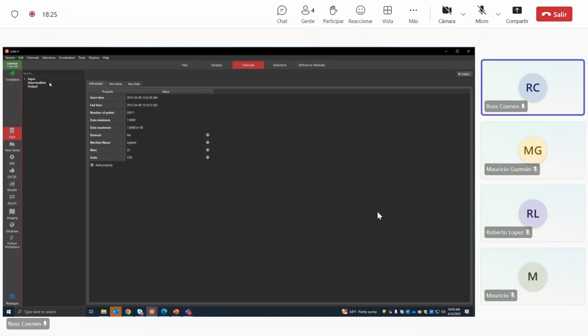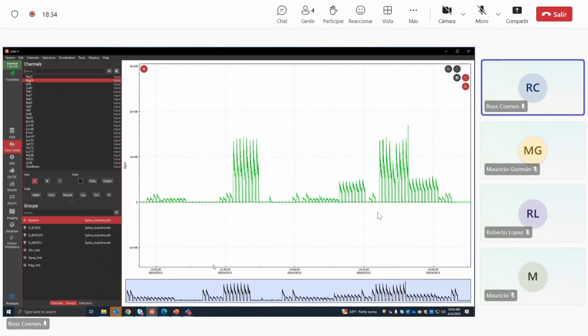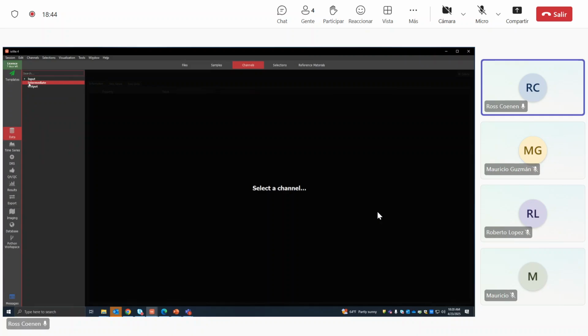Once we run blank subtraction, then we'll have intermediate, and it'll be these same elements, but it'll subtract whatever this baseline value is down here. So if you have a sample like silica or something that has a really high baseline, it'll subtract that from the actual data. And the baseline subtracted data will go in intermediate for all of these elements. And then once we run full quantification and we get concentration, concentration will fall into the output tab.